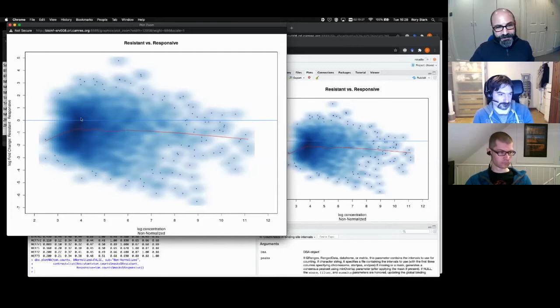that helps you see the shape of your data. And usually there is a center of gravity down here, a point of greatest concentration of your peaks. So every dot here is one of those 2,700 peaks. You'll notice that the center of gravity here is below the line. Below the line means that it's more enriched in the base condition, which is responsive. Resistant minus responsive, so it's negative, so it's more enriched in the responsive condition. So we observed that about our data.